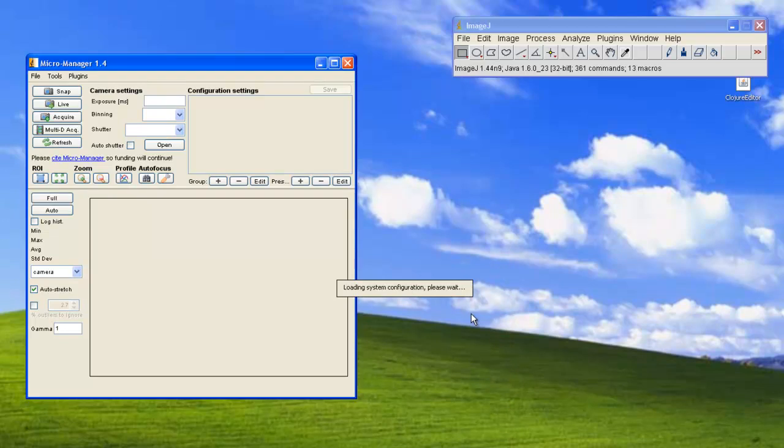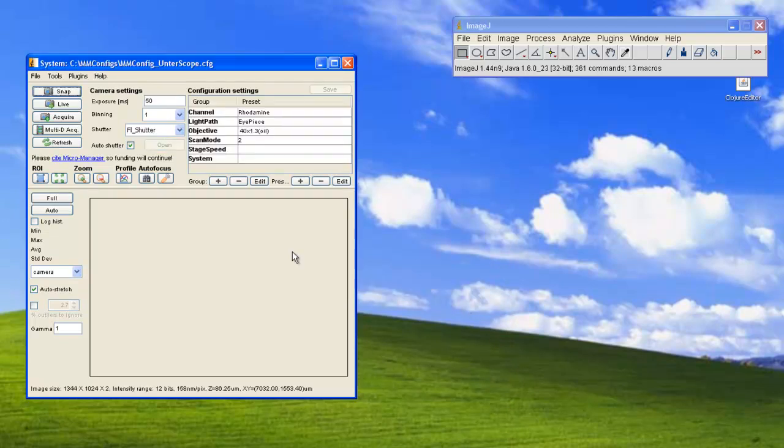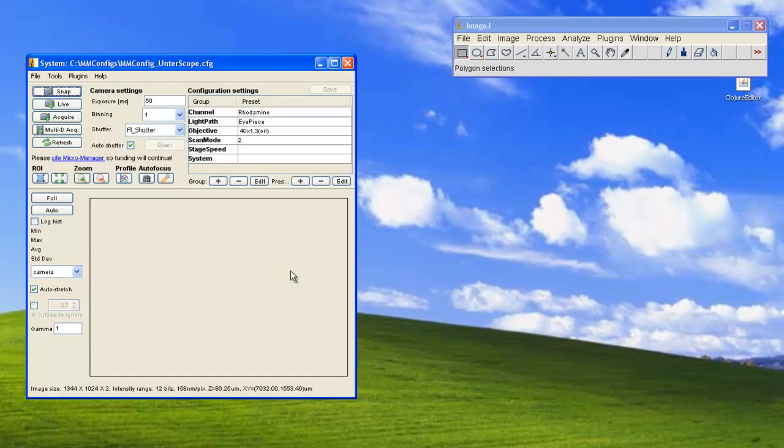As we wait for the file to load, we can see the MicroManager interface to the left and the ImageJ interface to the right, both of which work together to provide you a complete microscope experience.